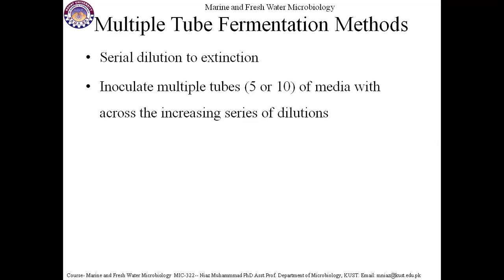Inoculate multiple tubes, 5 or 10, of media across an increasing series of dilution. Suppose in the first test tube set, where lactose broth is present in all sets of test tubes, for the lowest concentration we are adding 0.1 ml of the sample in 3 test tubes, 1 ml of sample in 3 test tubes, and 10 ml of sample in 3 test tubes.